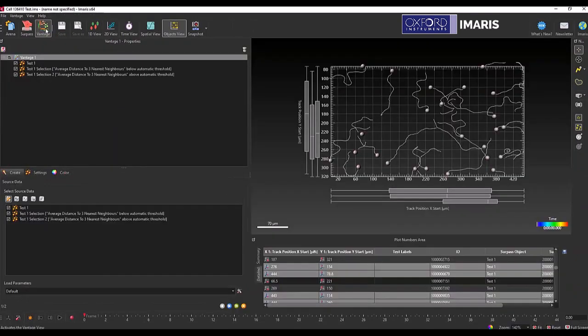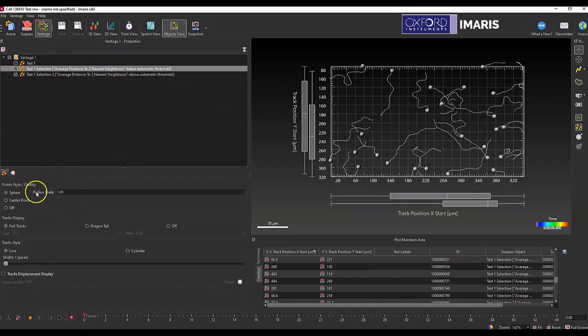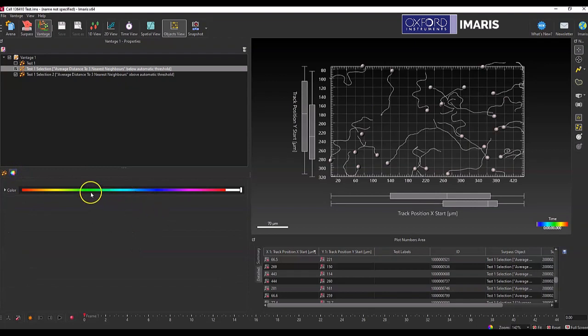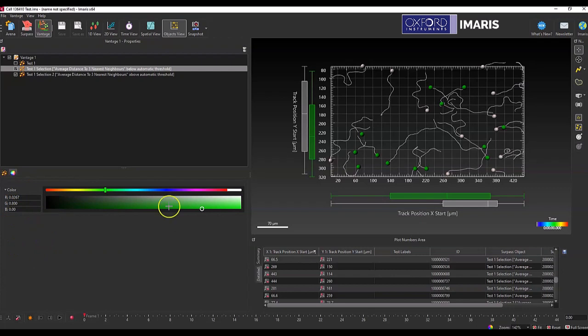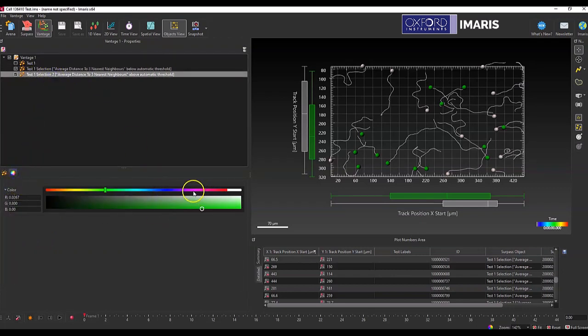And then in Vantage, I would go into here and display those two different labels, have them displayed on here, and then I can color them different colors and pick that. And I can type in the RGB values for those also if I want them to be the exact same for what was displayed in the 1D and the 2D view, or those label colors. I can enter in those RGB values just by extending this menu here.